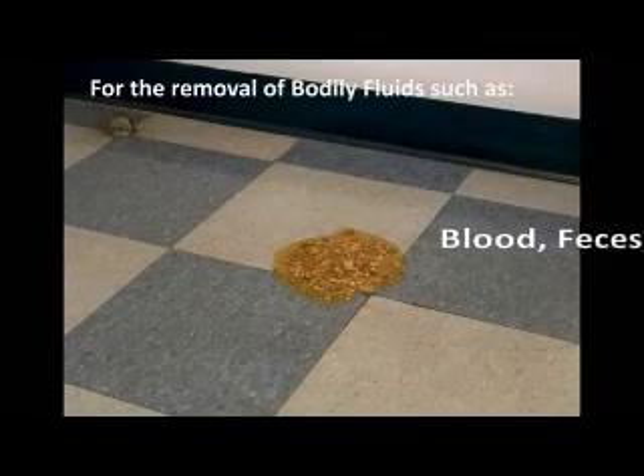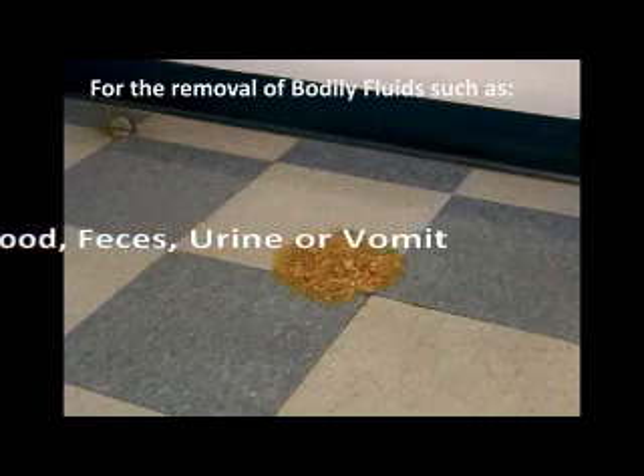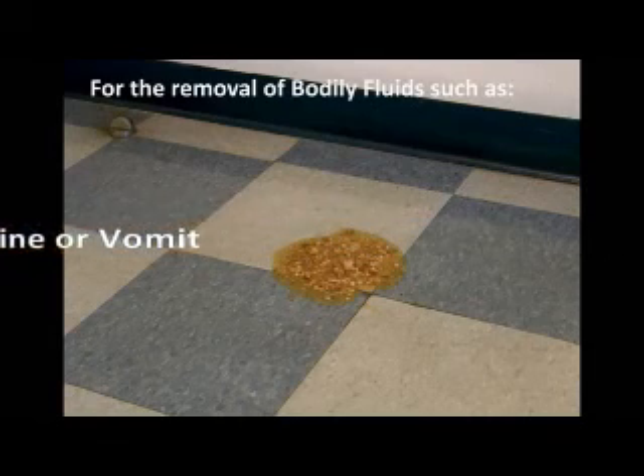The kit can be used for the removal of bodily fluids such as blood, feces, urine, or vomit.